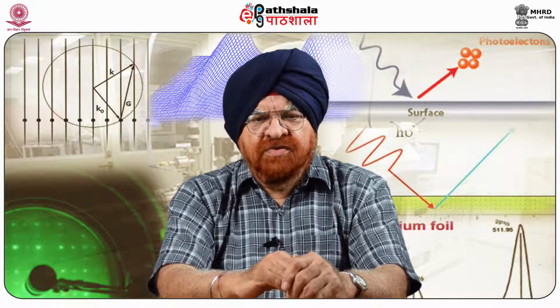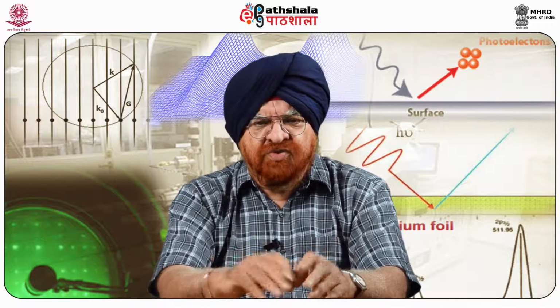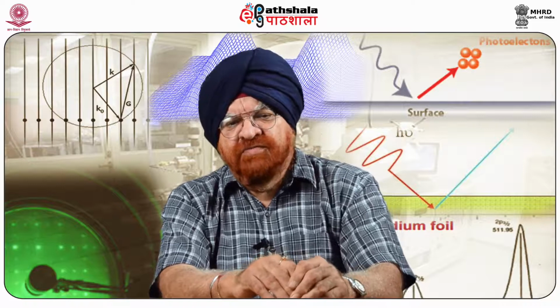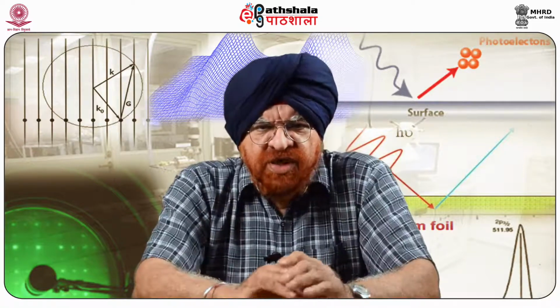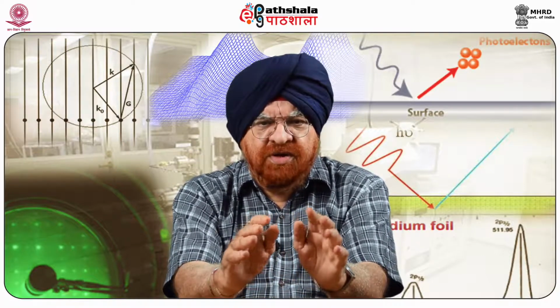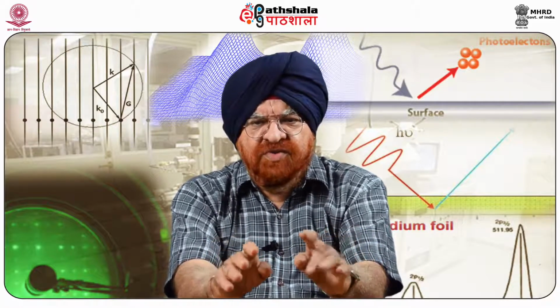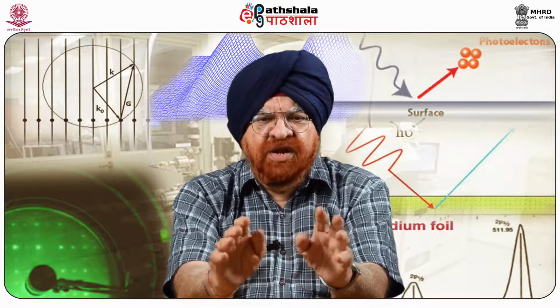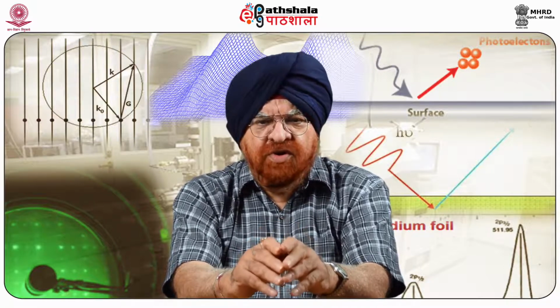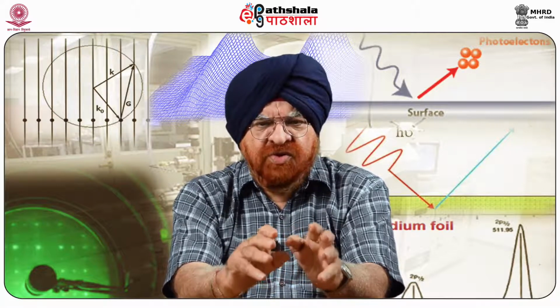In the introduction, we will read that it is a variation of atomic force microscopy, which has become a versatile tool for characterization of material surfaces. With AFM, the structure morphology is probed using simple tapping or contact modes that utilize van der Waals interactions between tip and the sample to maintain a constant probe deflection amplitude. That's called constant force mode, or maintain height while measuring the tip deflection, that is constant height mode.